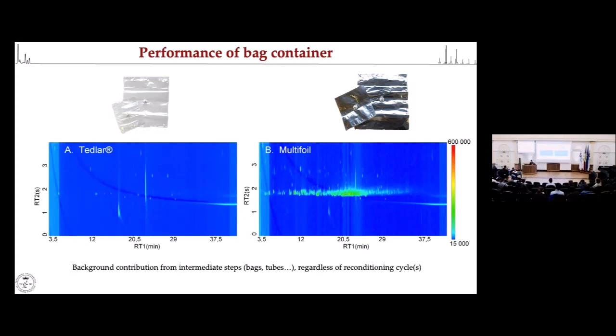And the same, even if I don't have the time to show results, the same can be said for the tubes. Tubes as well, they have a background release, a constant release, one desorption after the other.